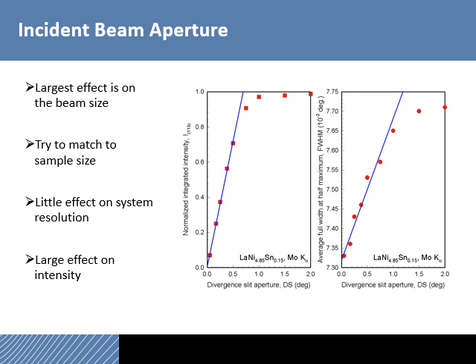Going larger is probably going to accomplish not much, except causing your peaks to start to broaden, and you'll have a lot more spillover on the sample holder, so your background will go up. Reducing it will actually reduce some of that background in the low 2 theta portion of the diffraction scan, but it will also reduce the intensity, sort of as the bullets say.